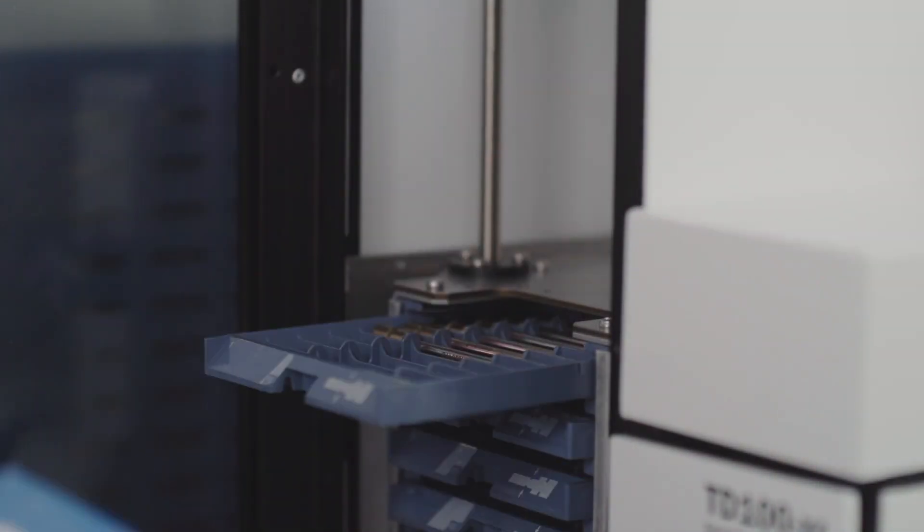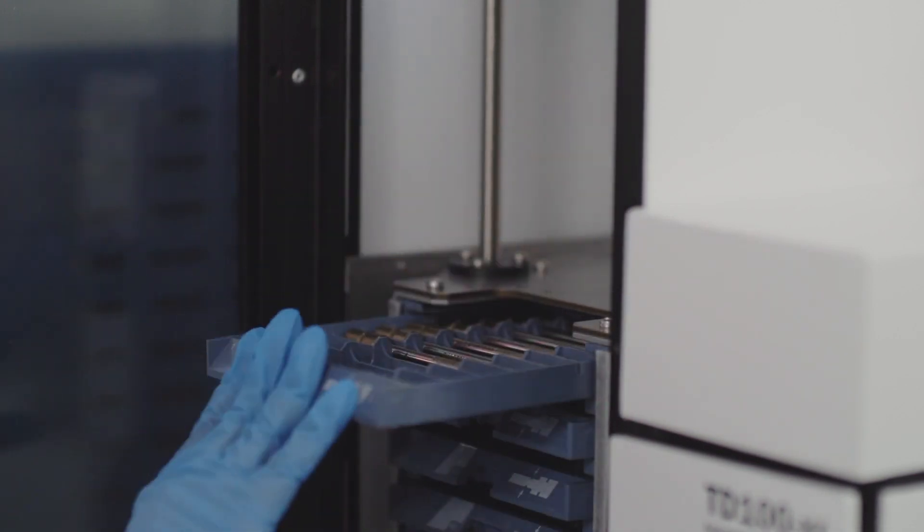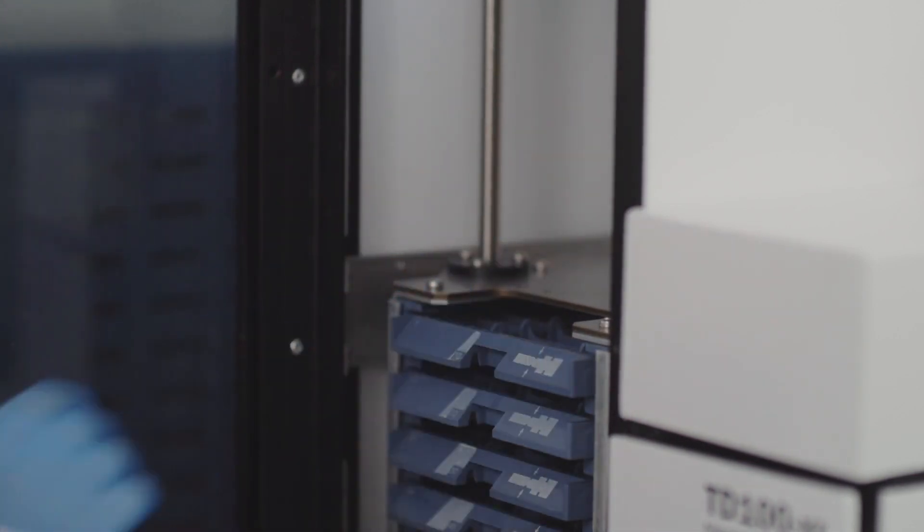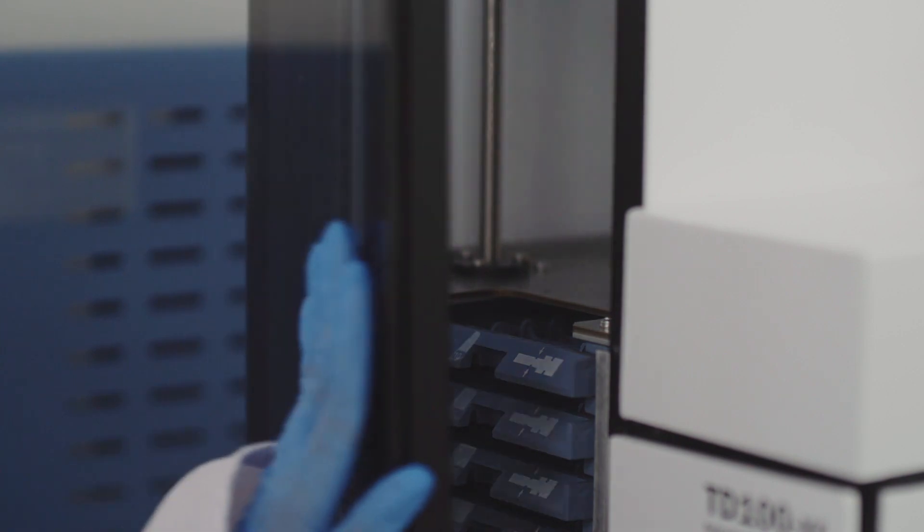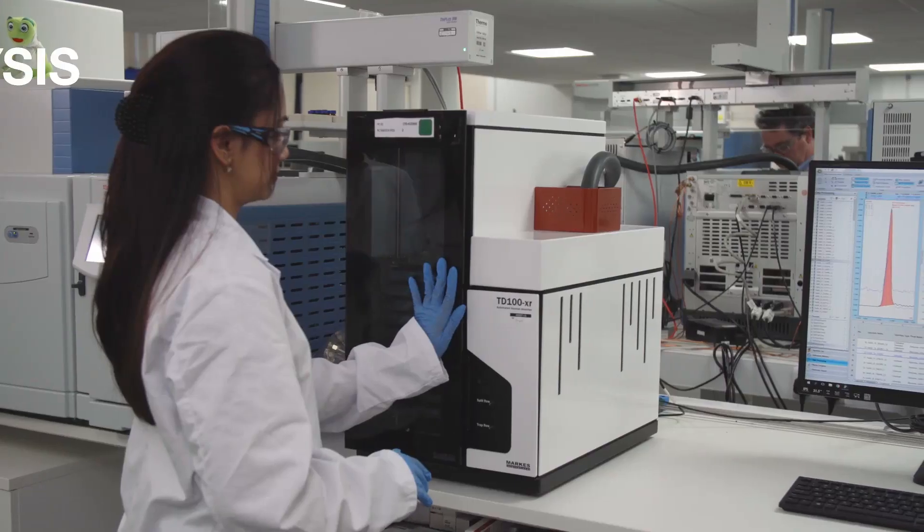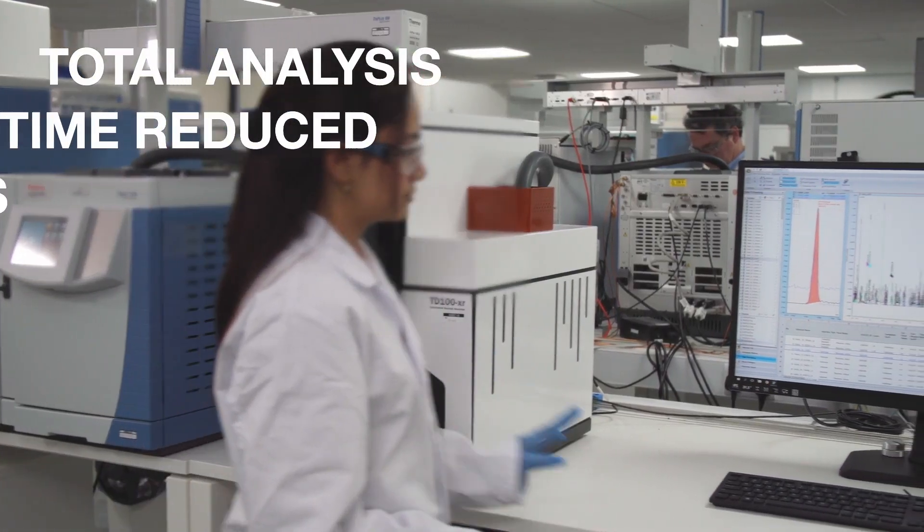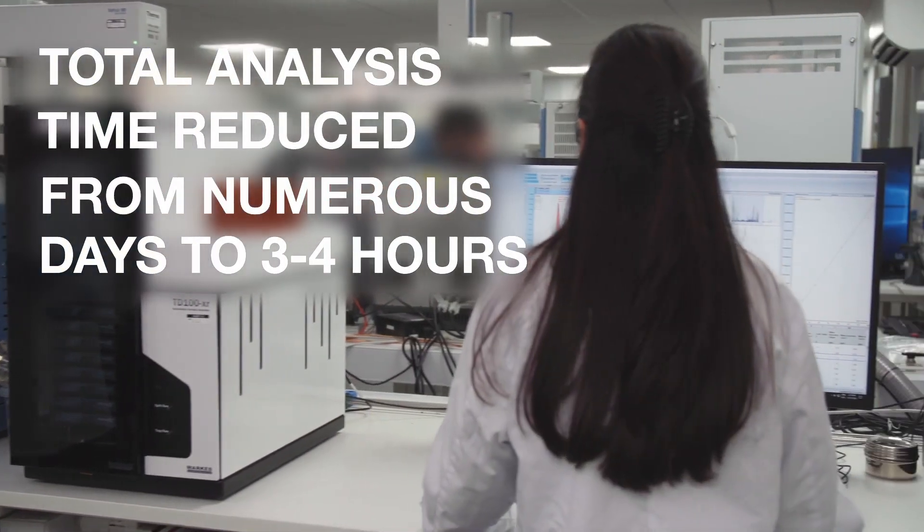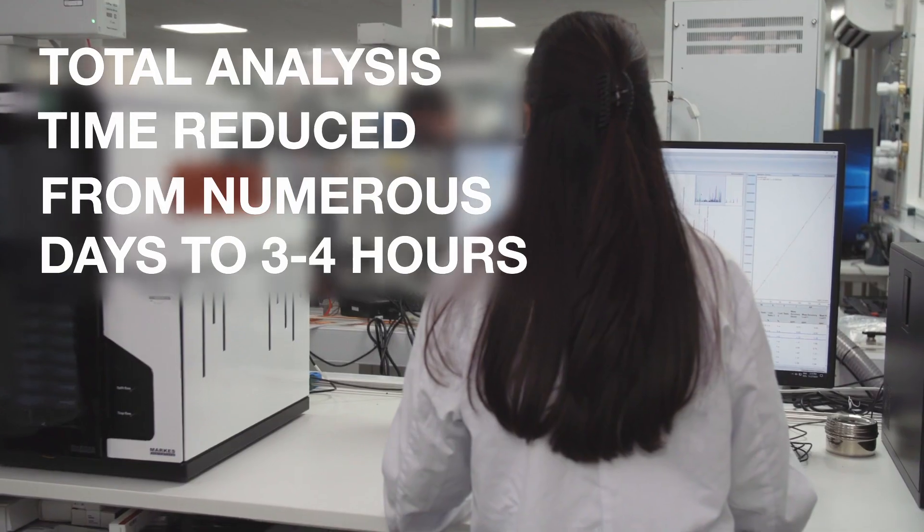Our previous batch process of up to 50 compounds per analysis has now been simplified to one batch with up to 250 components, and a total analysis time from numerous days down to three to four hours.